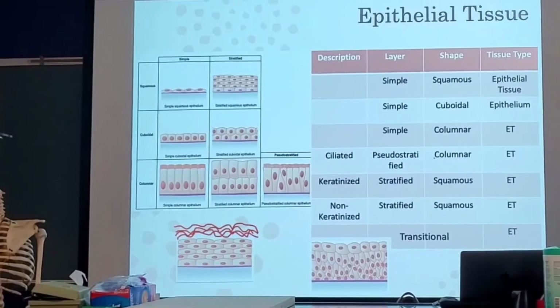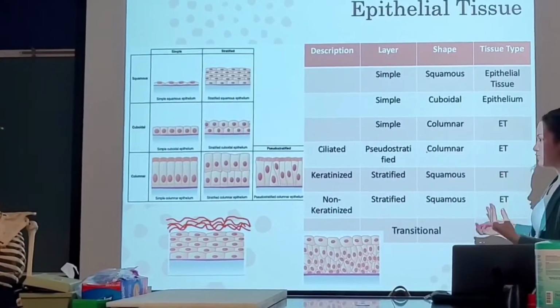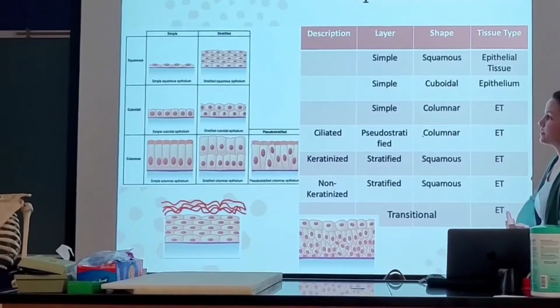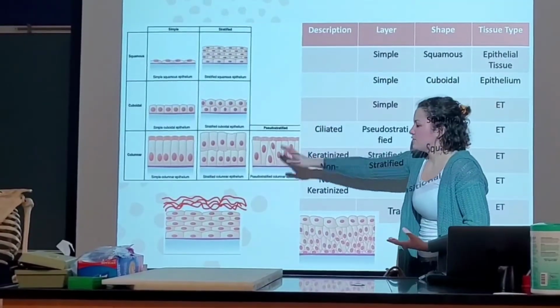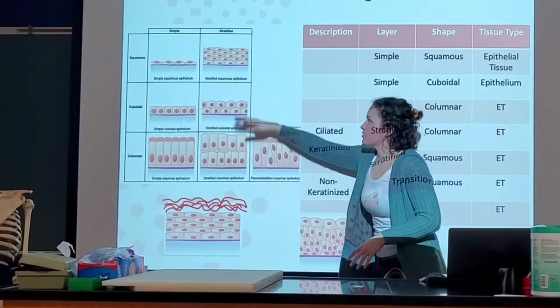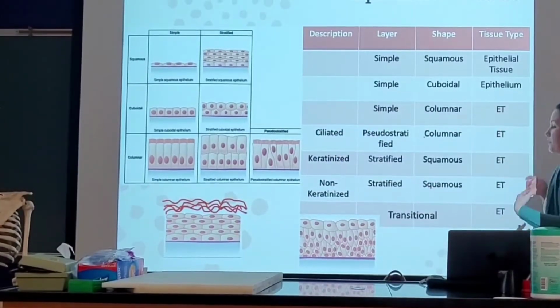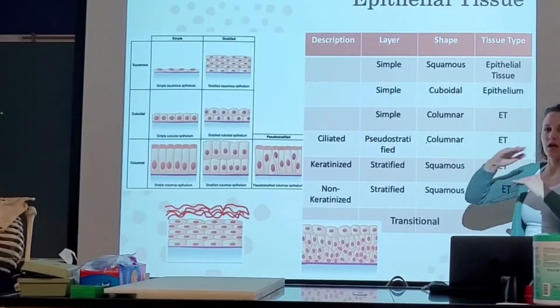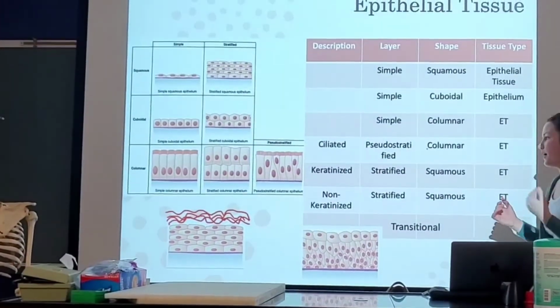All right, so next we have actual stratified cells. All right, so stratified, there are multiple layers. Now, in these 2D images, some are just 2 or 3 or 4, okay? This is a lot of layers. It's not actually numbered. It's just a lot of stacked cells, okay?